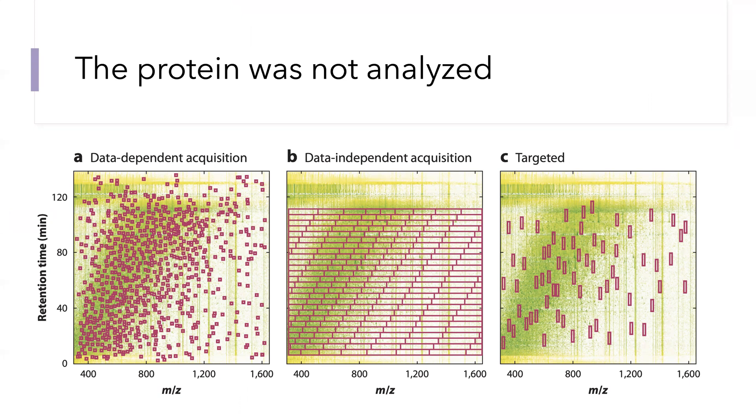In each case, the heat maps show the ion maps of the experiment where individual ions are being plotted in yellow and green depending on their abundance. Green corresponds to high abundance, yellow to low, in the space of m over z versus retention time, while the particular ions isolated for analysis are circled in red squares.